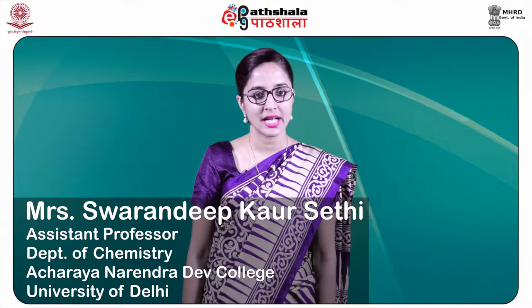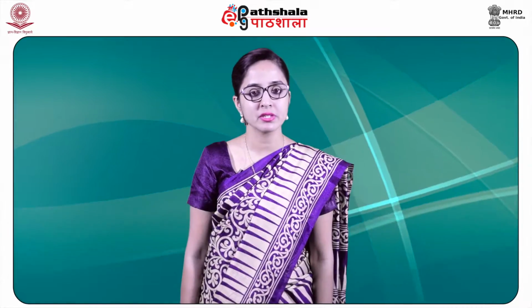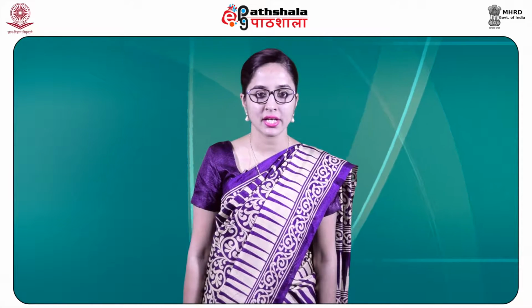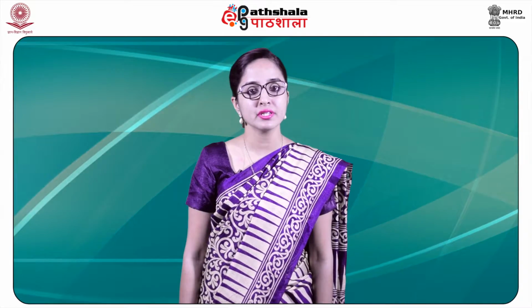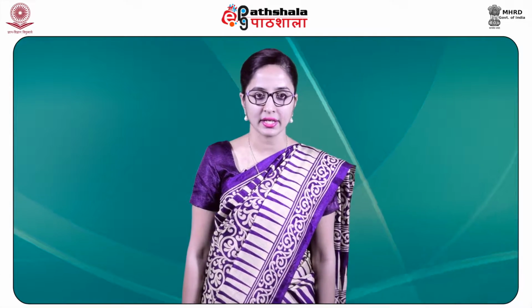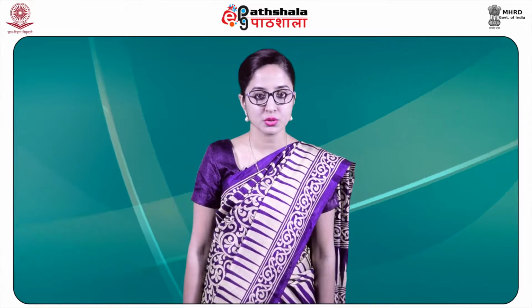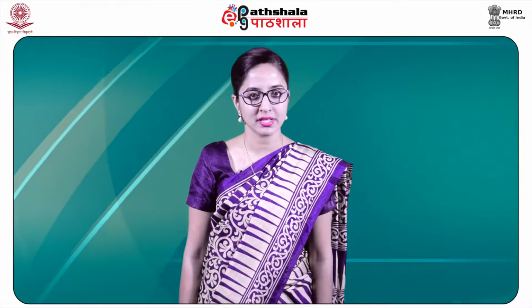Dear students, after studying this module, you shall be able to learn about the principle of gel electrophoresis, polyacrylamide and agarose gels, composition of gels, the difference between denaturing and native gels, and why we need radioisotopes and what is their biological importance. You shall also learn about the applications of radioisotopes in medicine.